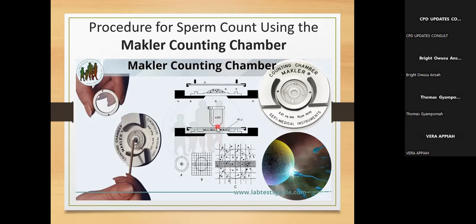This working distance reduces with higher magnification. So you see that if it is times 100, once it's in focus, there's virtually no space between the slide and then the objective. Just a little space, and that little space is what is filled by the oil immersion. Okay. Now with the times 40, there is a space there, but that distance is also short. If you use the times 10, the space is a little bit wider.